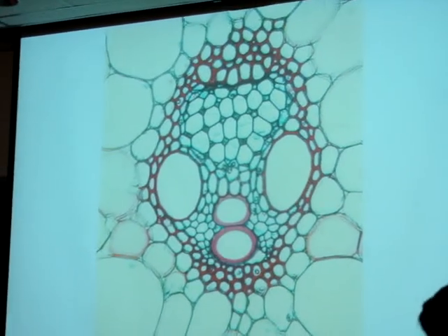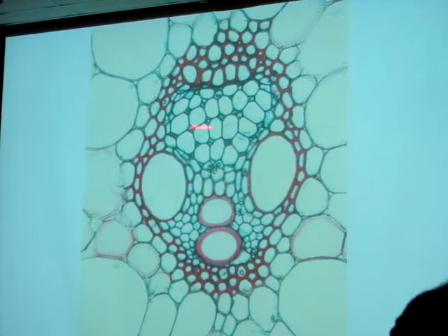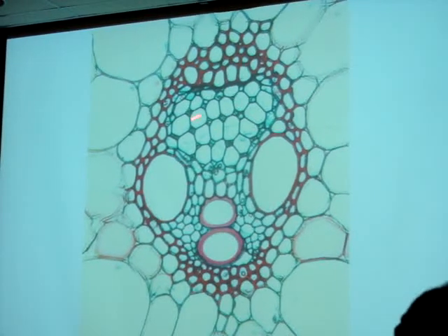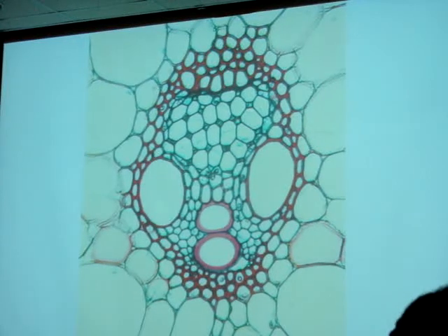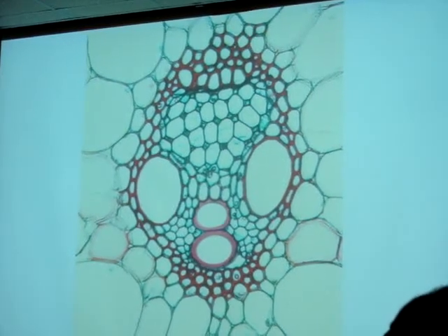That's the only way you can tell the difference between the two xylem types. Here, the xylem. Now that we're looking at this in cross-section, we can tell the two different types of phloem cells. So the large ones are the sieve elements, the small ones in the corner are the companion cells.